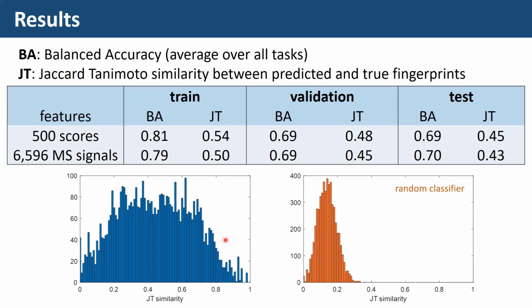As usual, you have good solutions, where the similarity approaches 1, and bad solutions, but at least these results are significantly different from those of a random classifier. So I think we were modeling something more than noise, because for sure these data are very, very noisy. But there was something in the models.